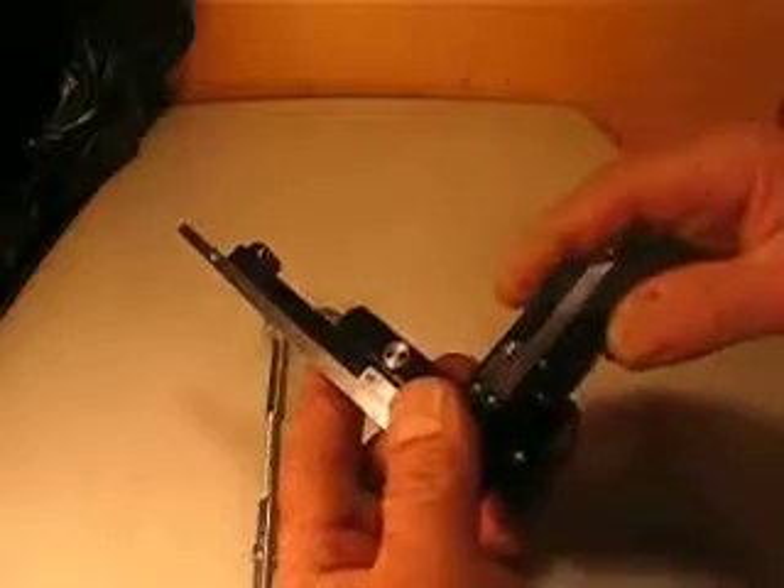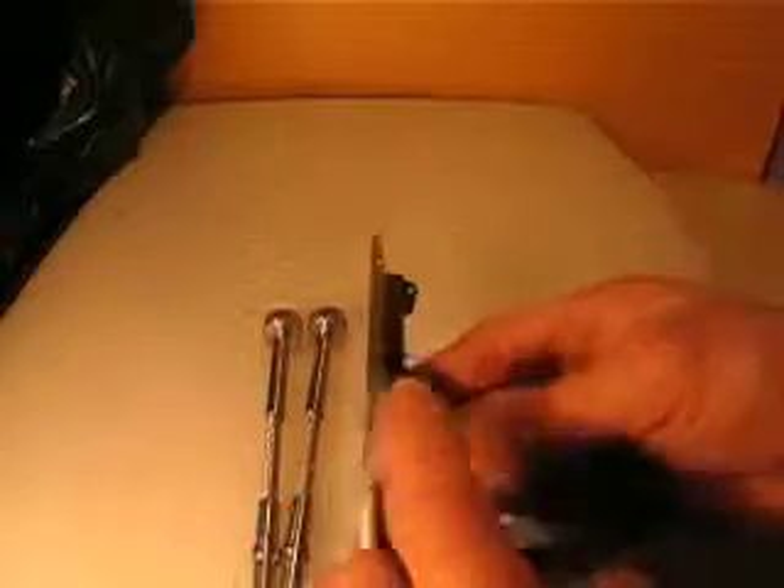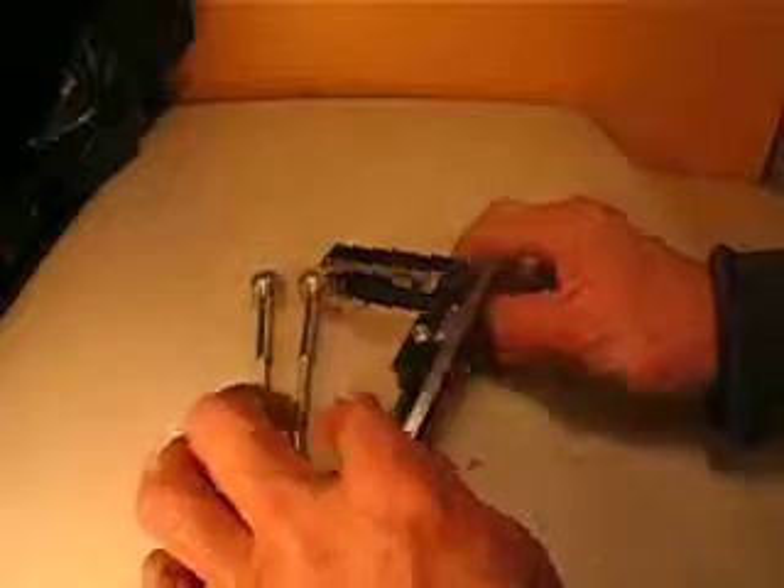You can take apart the axis or use it with dial indicators and another microscope, linear actuator, or whatever. And I maybe want to put the other one that I took apart in for half of the price. Or if you are interested, just let me know and I can include the whole thing in one package.